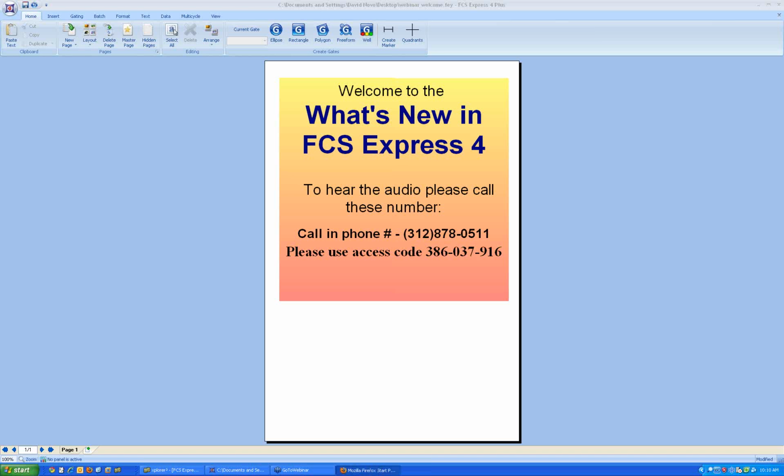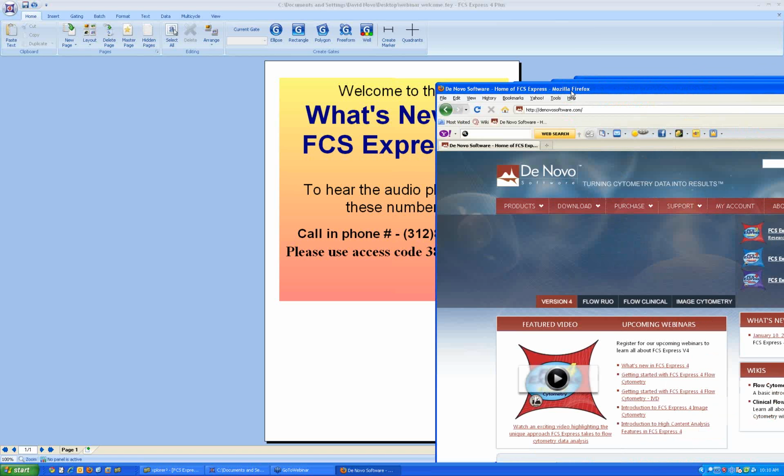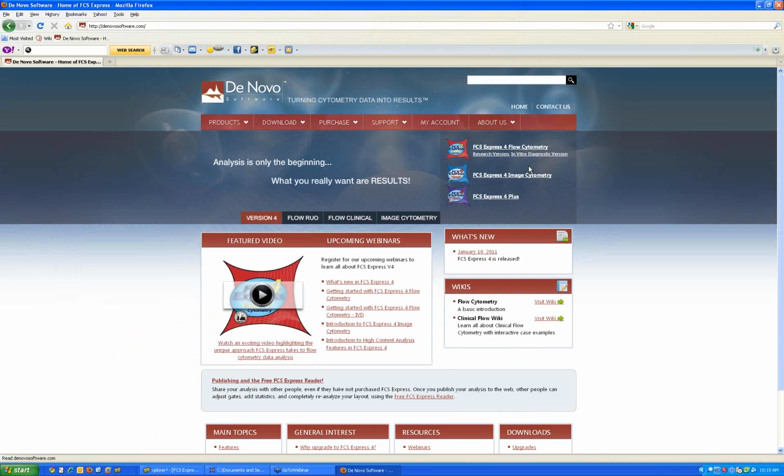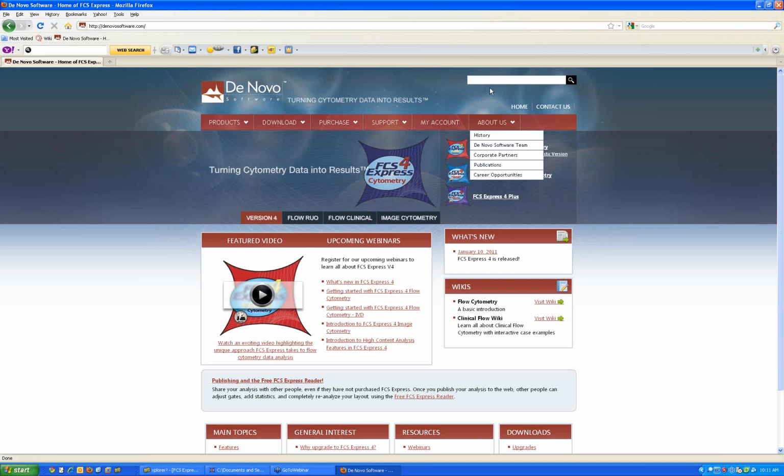In fact, one of the first new things that I'm going to show you guys is our new website. The website has been completely revamped, still at www.denovosoftware.com, of course. What are the useful things for you guys as people who are upgrading from version 3?